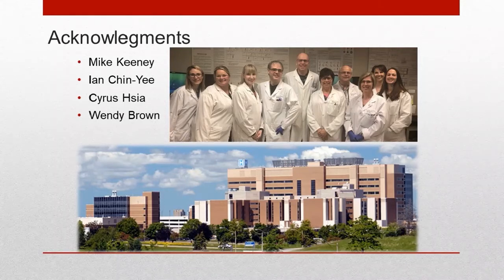Thank you. One of the audience members is asking, why is CD23 not included in the B-cell tube? Well, that was a decision made more recently than some of the other markers. There's a lot of discussion in the literature whether CD23 or CD200 should be used. Depending on which publication you read, you can get better results with CD200 or you get CD23. Some guidelines say that 23 is better than 200, others say the inverse. They both do the same job. They differentiate CLL from mantle cell.